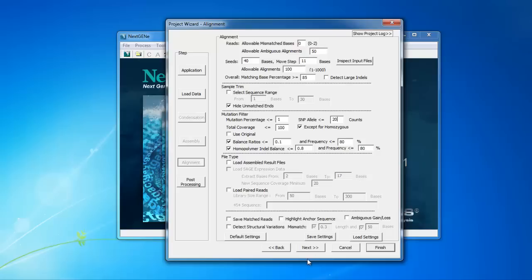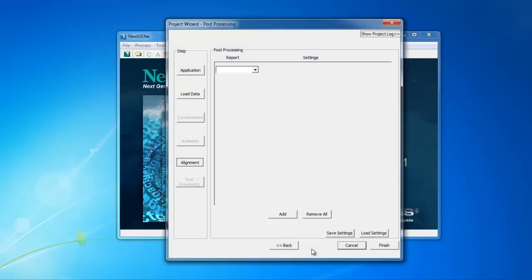Once you've selected your settings, you can click Finish here to begin processing the data or optionally click Next to use the post processing step.